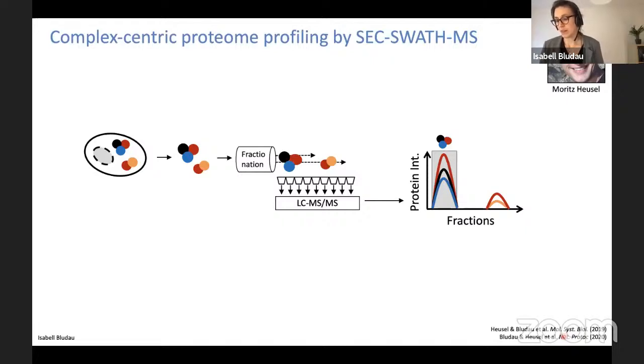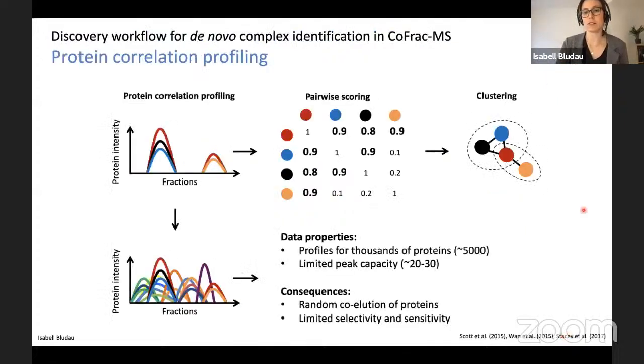Okay, then there is one question about the machine learning steps for clustering analysis. Basically what is done in these analysis approaches is that you usually take prior information from high confidence protein complexes annotated in CORUM, for example, and these are used as a ground truth data set for the machine learning.